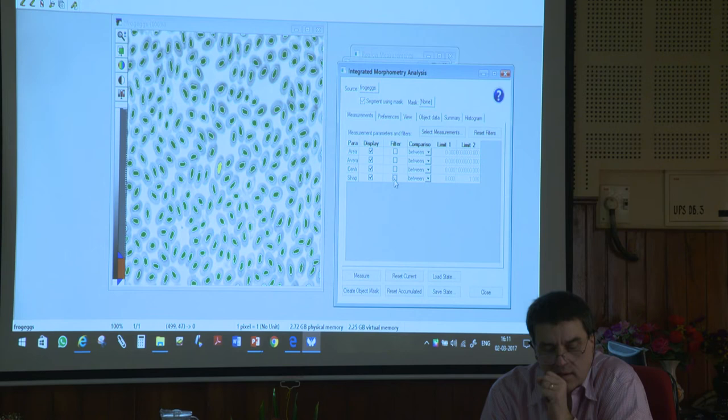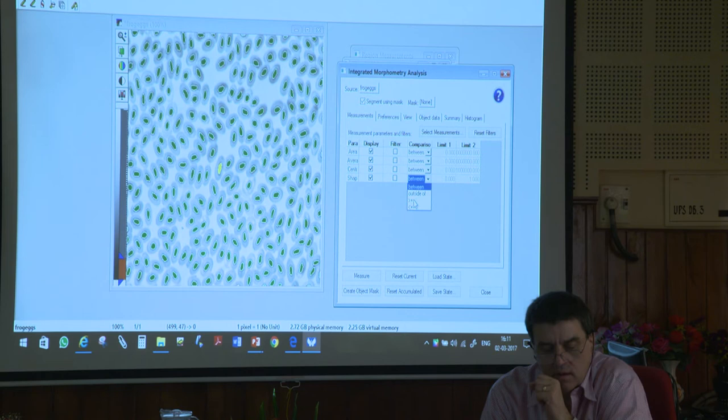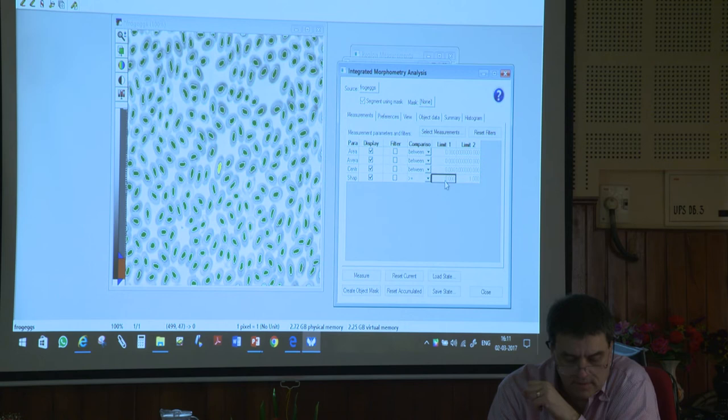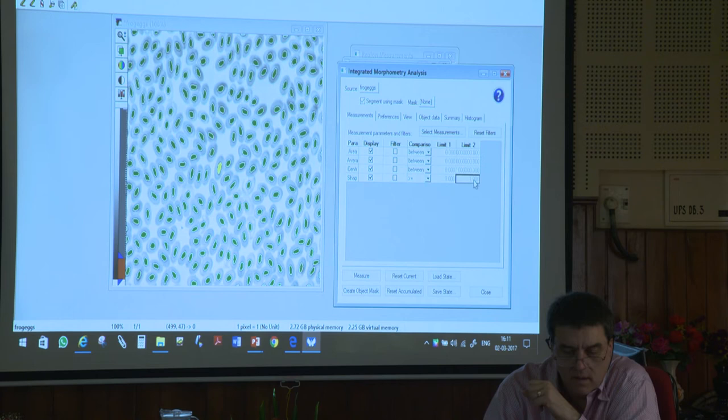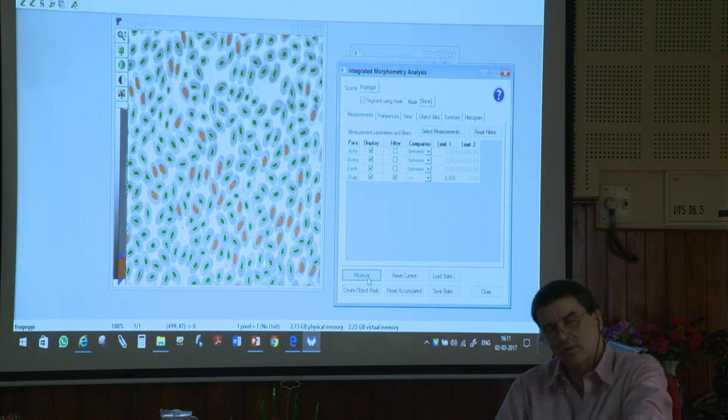So what we're gonna do is we're gonna say, okay, I only wanna look at ones that are greater than or equal to, and we'll make this, let's just say zero. I always have trouble with this thing, 0.8. Gonna fight with me. Okay, let's measure again. Oh, I know why, because I got a filter. Okay. Okay, so I'm gonna measure again. Okay, orange is not being counted, green is being counted.